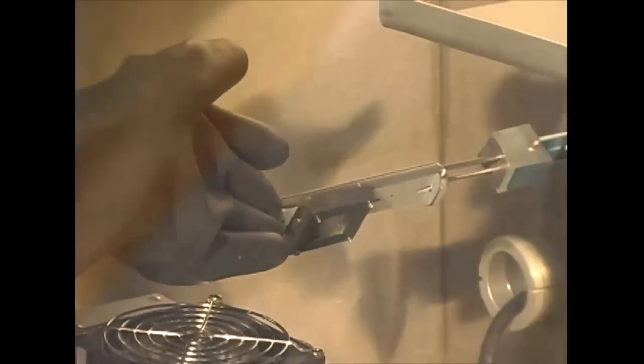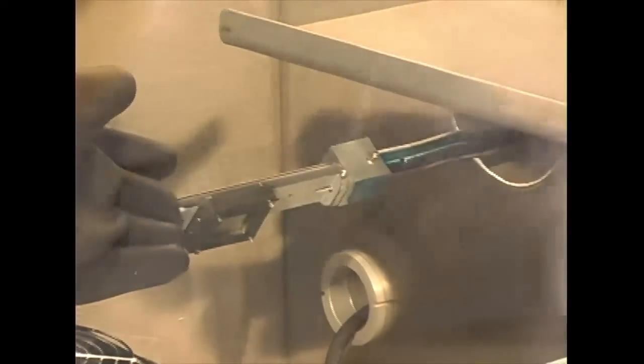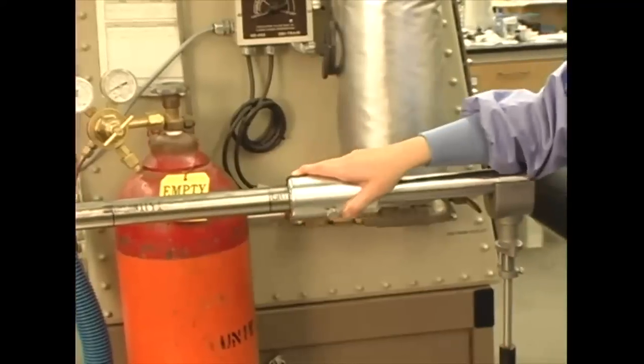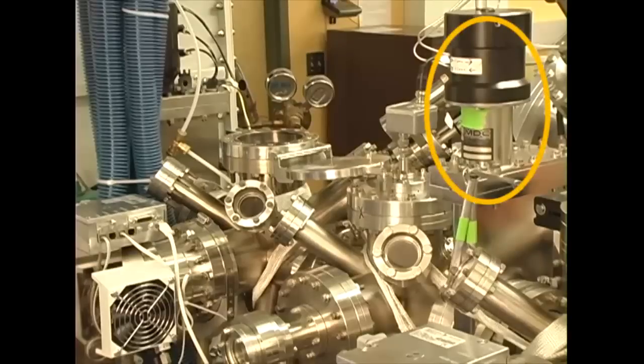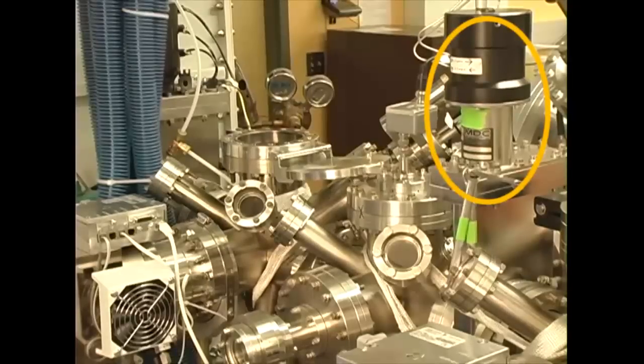The sample boat is loaded onto the extendable arm. The arm and boat are drawn into the vacuum portion of the apparatus. The gate valve is closed and the system is ready to be evacuated.